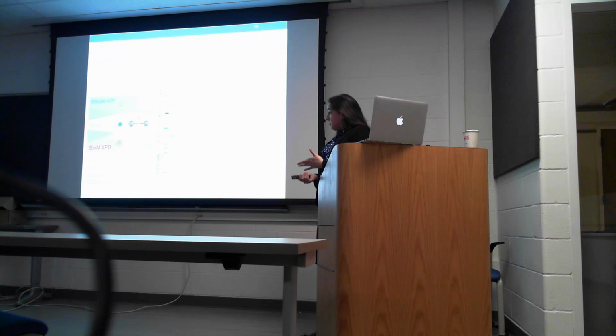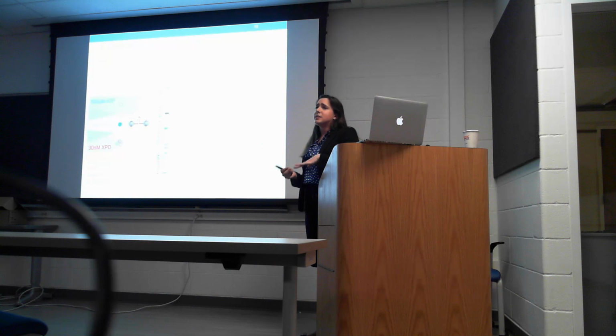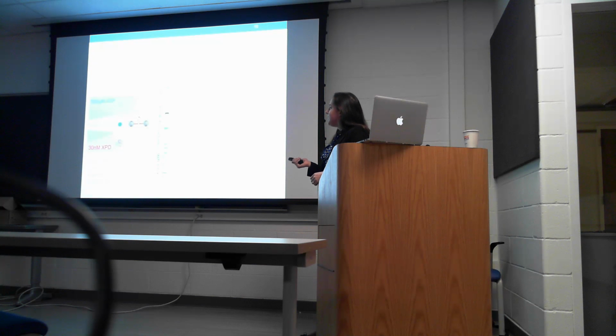So for demonstrative purposes, I'll show you that whole thing again, but this time with the data that we take. And I've loaded a fluorescent dye into the central channel. That's just for illustrative purposes. I'm not going to show you any fluorescence data after this. Just when this dye intensity is high, it means we're in the middle, and when it's low, it means we're not anymore. So we begin in the center with this high intensity.